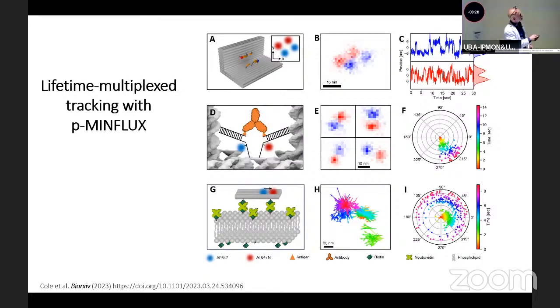So you see, here they build a DNA structure with a flexible DNA bridge with 2 epitopes for an antibody. So when the antibody binds, this DNA bridge that is flexible will reflect the position of the epitopes with two fluorophores. So now by measuring these two fluorophores, we can measure distances between epitopes without disturbing the epitopes.